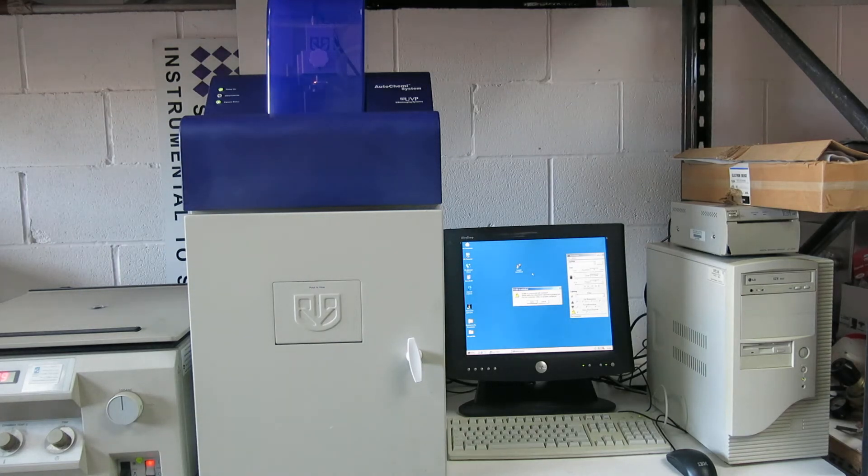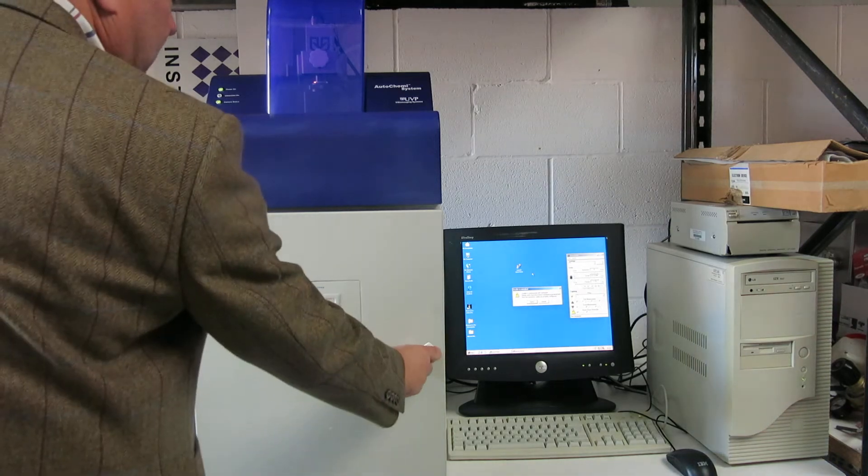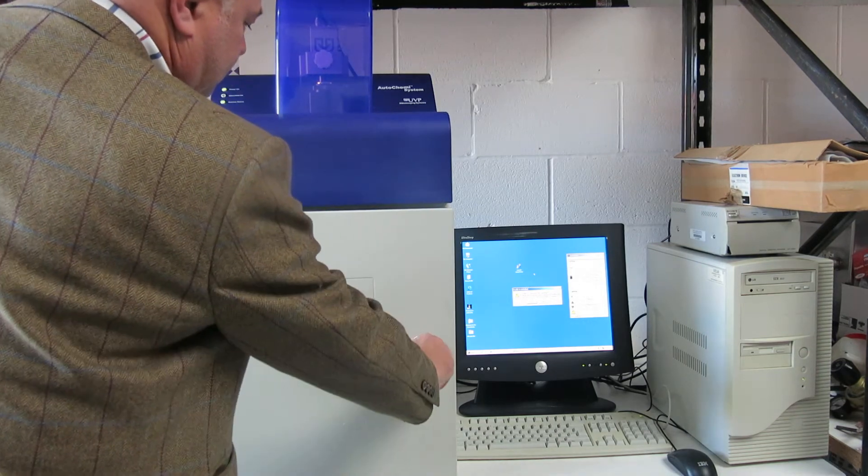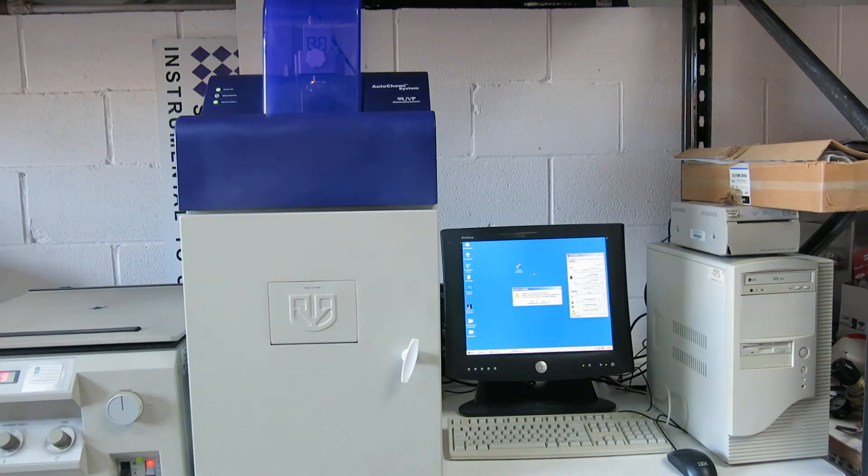This is the AutoChemy system UVP bioimaging system. If you just open it up now, you can see inside here — it's inside there.